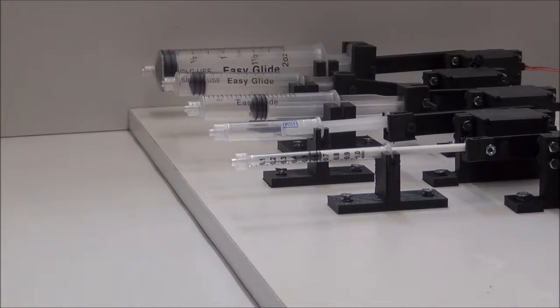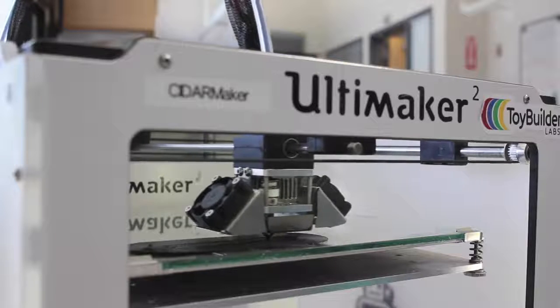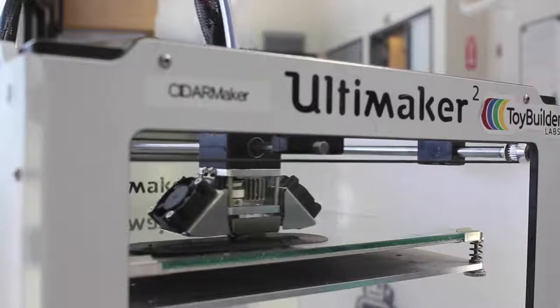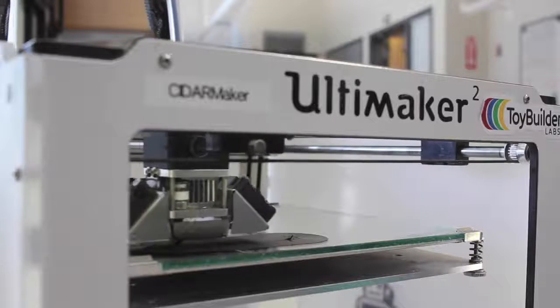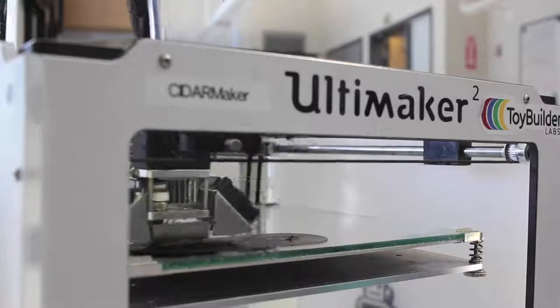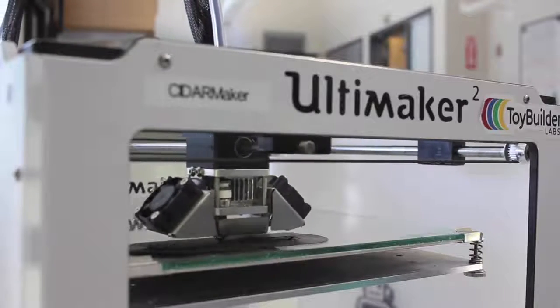Should our servos or syringes not have the required tolerance or volume, users can input their own parts. Neptune automatically creates 3D parts to fit them perfectly. Neptune can adapt to the user's specific project needs, providing a wide range of possibilities along precise levels of control, all at a fraction of the cost of conventional fluid dispensing systems.